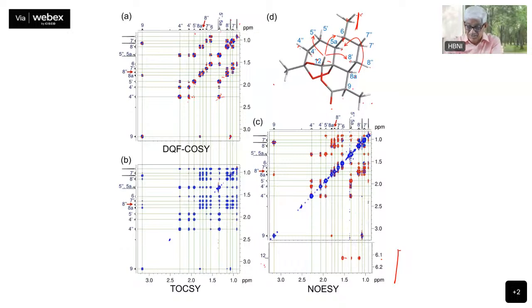And that is showing to these ones there. So the combination of all these NOEs will confirm the analysis. All right, so this can be continued. Those of you who want to do more on this, go through every one of these peaks and establish the connectivities. It does not have any COSY relation because all the surroundings are carbons. So there is no COSY, that's why this spectrum does not contain that region at all. All others are quaternary carbons and therefore.